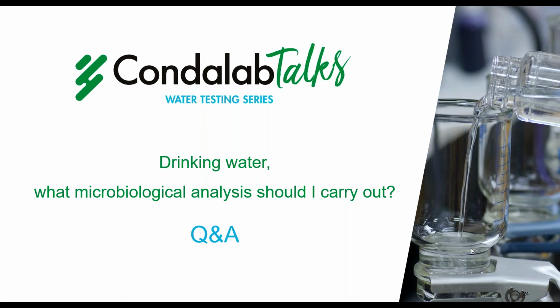Then on to some technical questions. In the membrane filtration method, is it possible to do the filtration without vacuum?